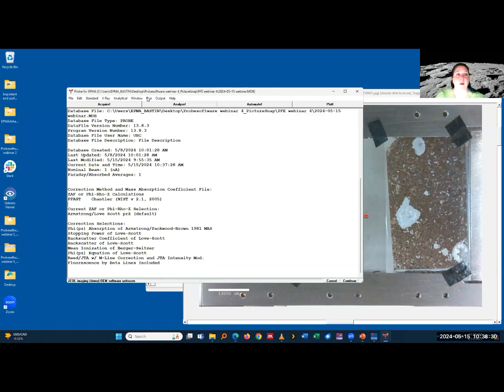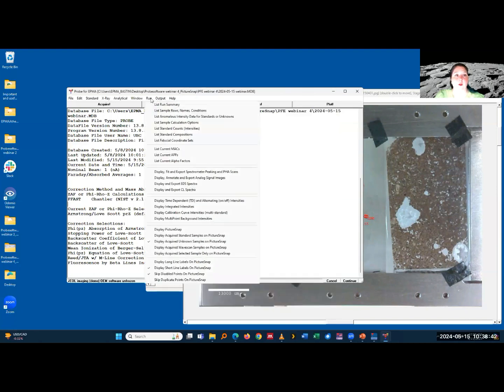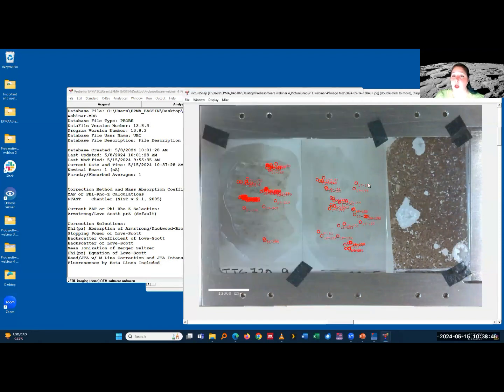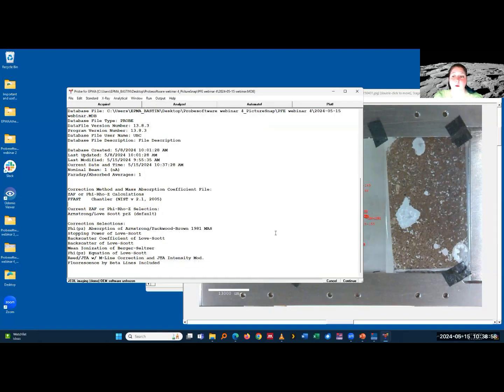And if I want to have them with the annotations that you also see in the Excel spreadsheet, they're shown here. They're short line labels, so these are just the line numbers. I can also have the long line labels, so then it would show the unknown number. On these overview images, this gets very cramped, but on a high resolution thin section scan, it's really, really useful. So let's take those off for the moment.